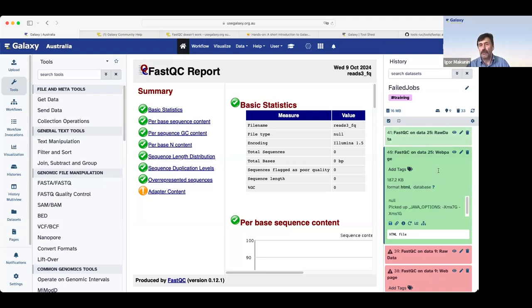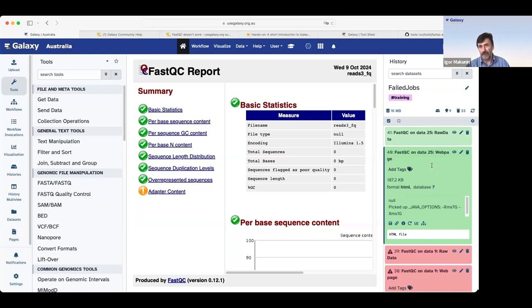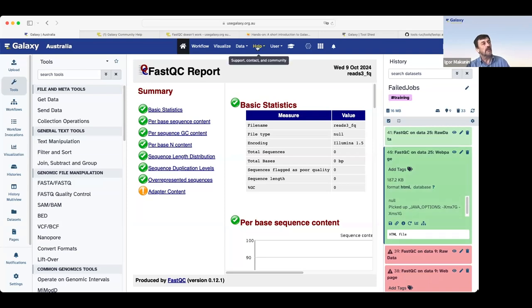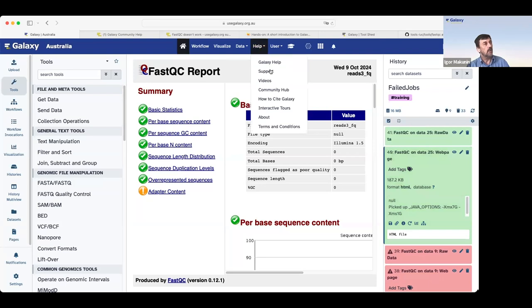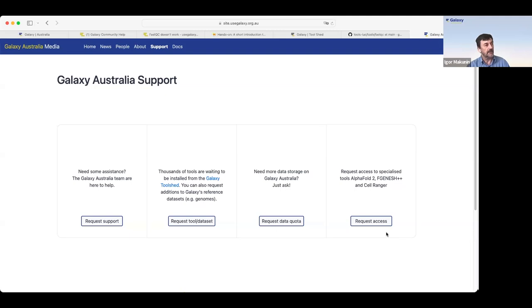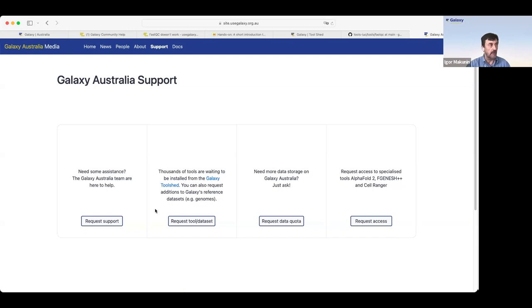Another situation, a user cannot submit a job because something is missing. It doesn't submit the job. In this case, a user can go to help, to support, and we click on support. On Galaxy Australia, you see several options, including request support. So it's possible to contact support team even without a failed job.